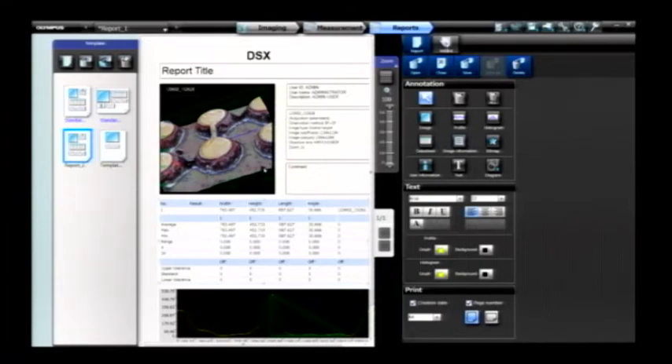This is a fairly new product — it just launched about a month ago. It's targeting a pretty large range of industrial markets, from medical devices to circuitry to semiconductor applications, because we have a broad range of optic choices. Rob Bellinger, applications engineer with Olympus — thanks for joining us and showing us the Olympus DSX 500. Back to you, Mike.